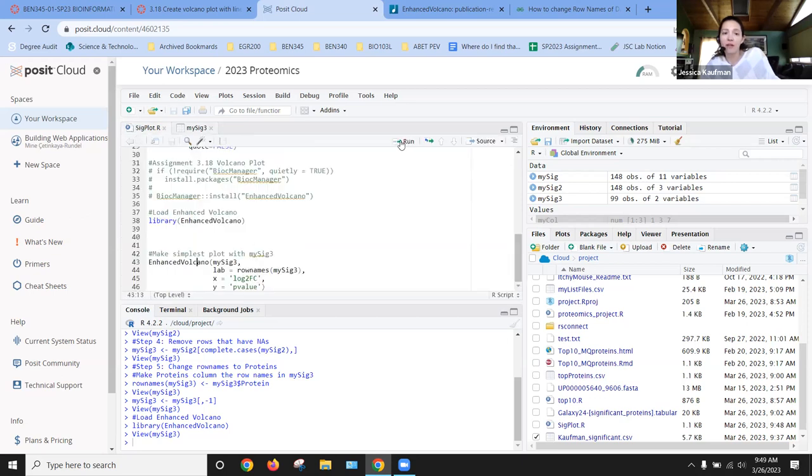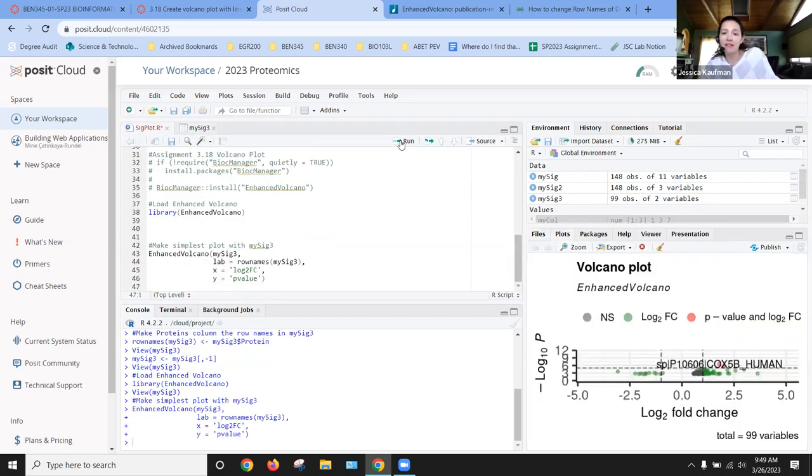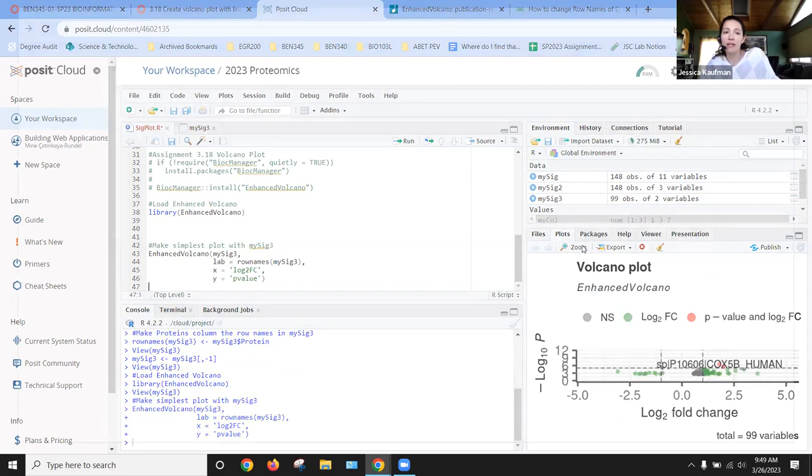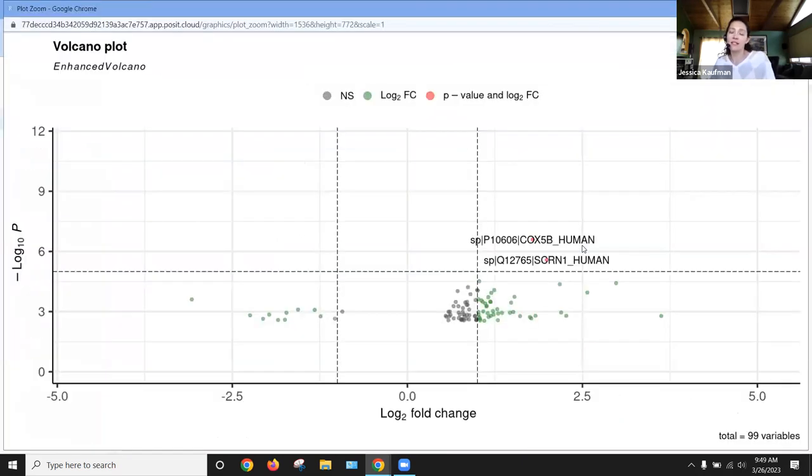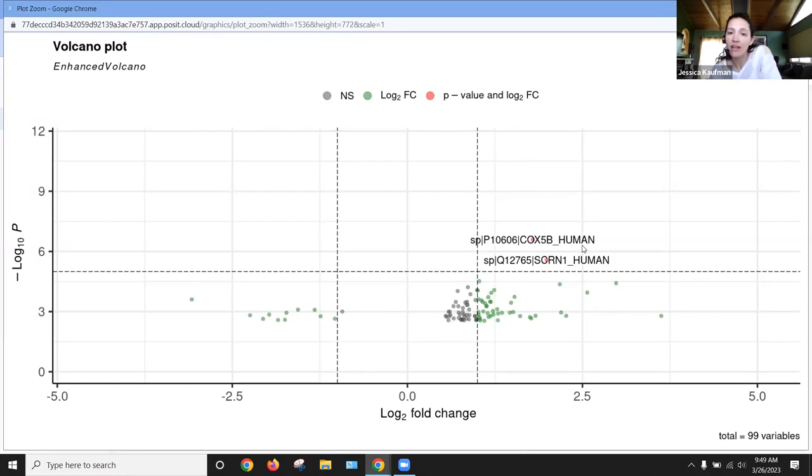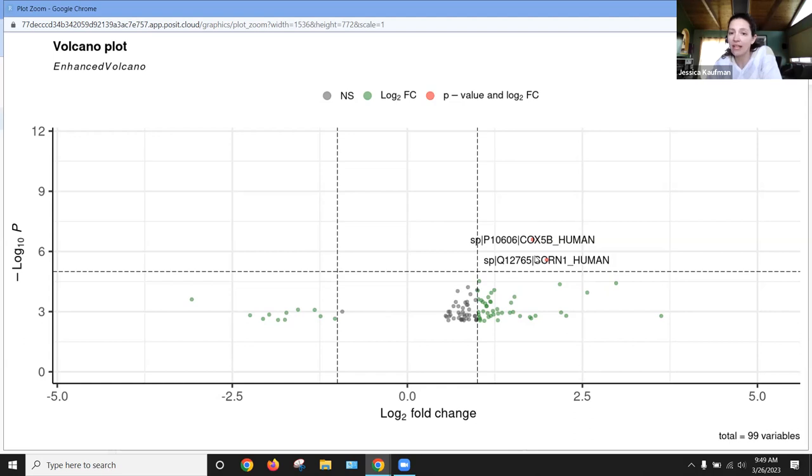So I'm going to run that command and zoom in on the plot so you can see what it looks like. And with the default p-value cutoff and FC value cutoff, there's only two proteins that are significant in this data set.